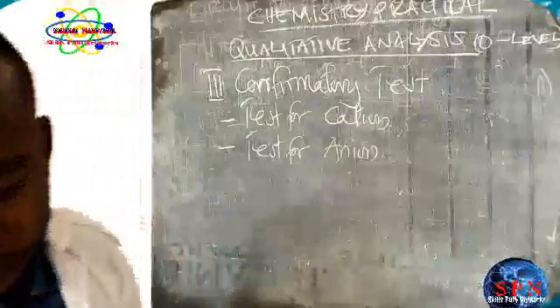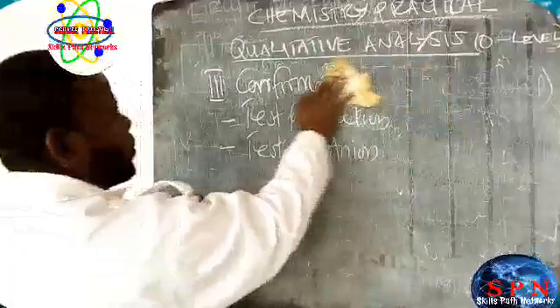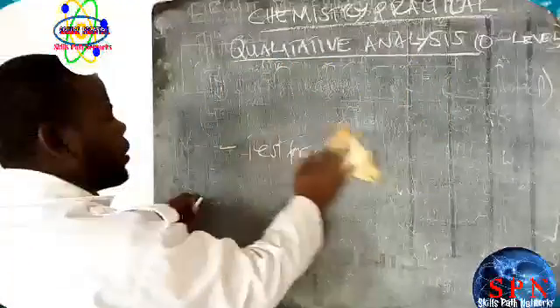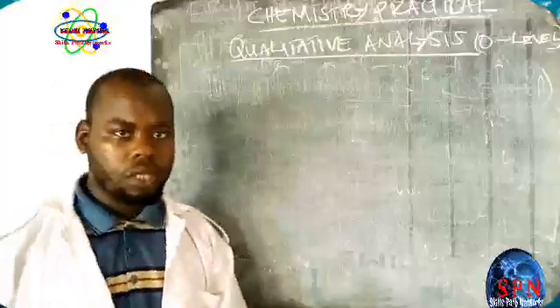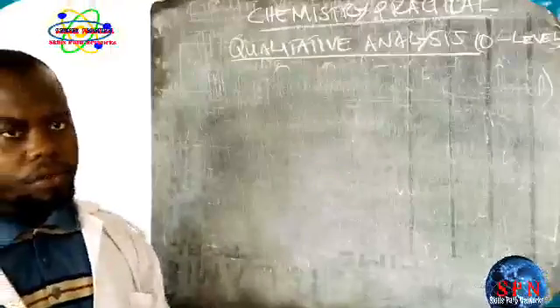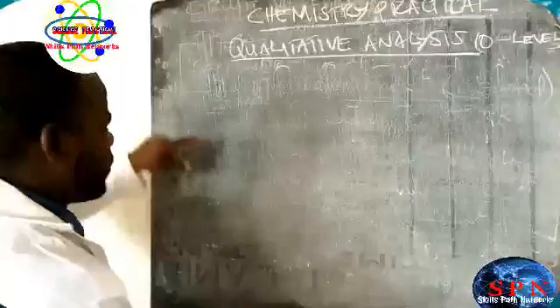After that, let's see which compounds we are going to study at O level. Students at O level should study the following.